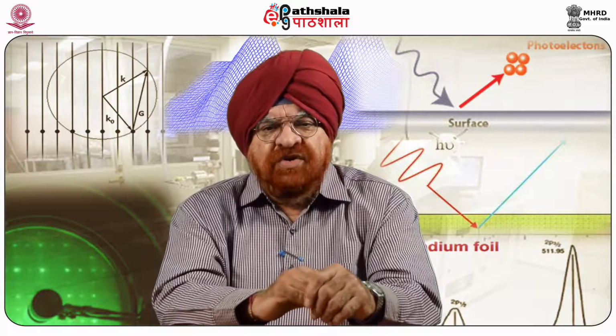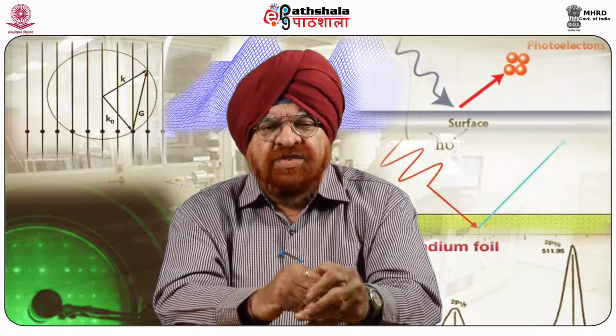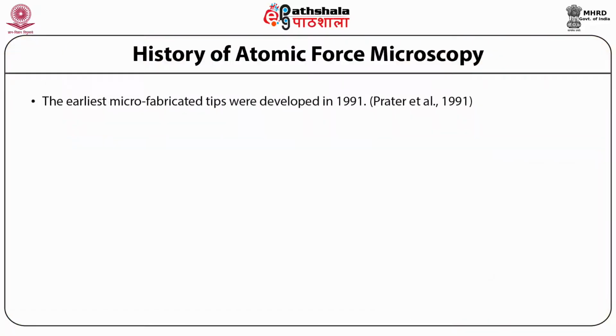The fourth generation prototype was developed in 1989, and this particular one sparked interest in the commercialization of AFM, so that it is used by every researcher, in electrochemistry in particular. The earliest microfabricated tips were developed in 1991 by Prater et al.